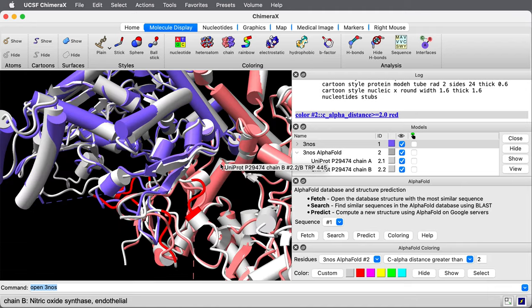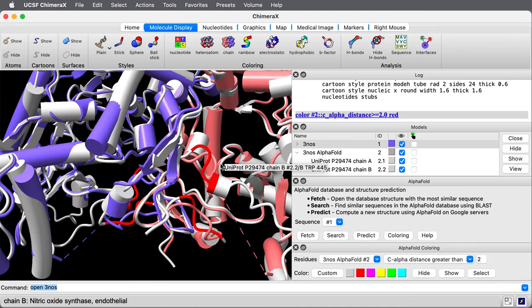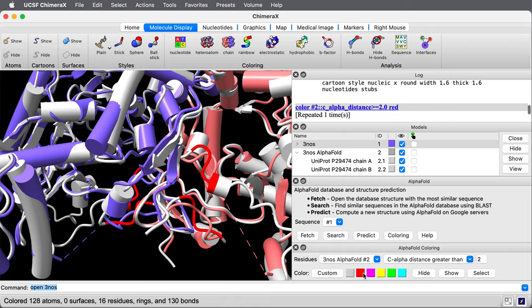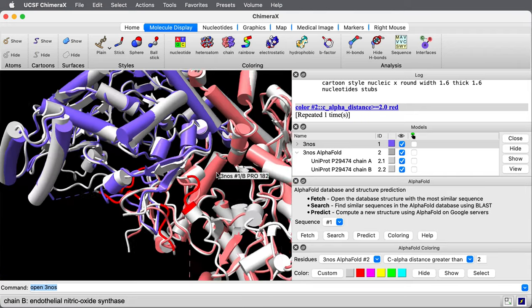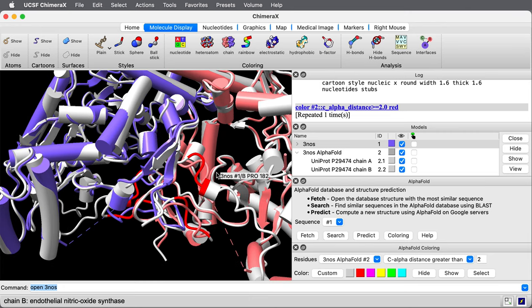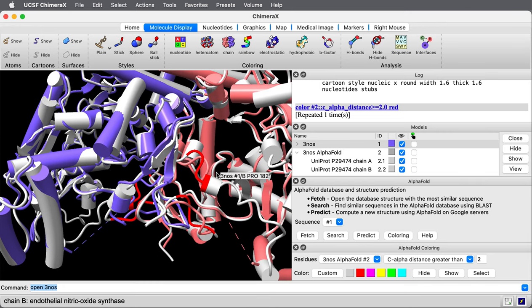Those positions that you see in red now have the C-alpha at least two angstroms away between the prediction and the experimental model. It's surprising. If we look in the status line, there are only 16 residues out of 800 total residues here. It's a dimer. There are eight residues in each structure that are more than two angstroms away. We see them in these turns.